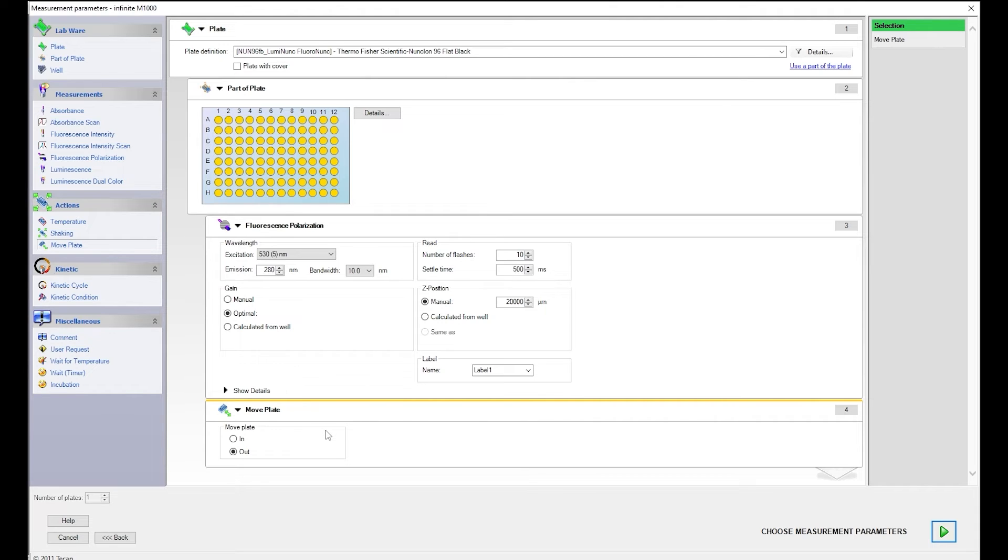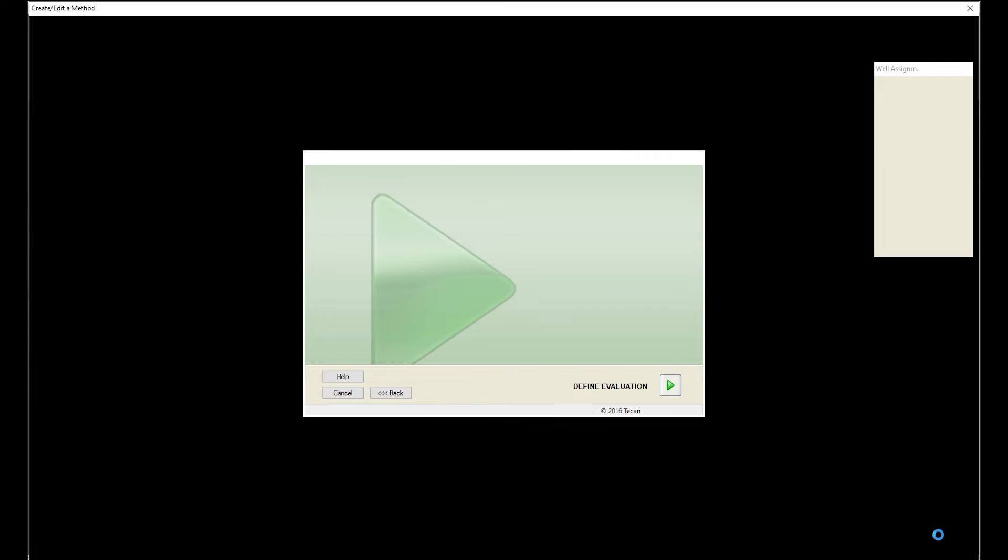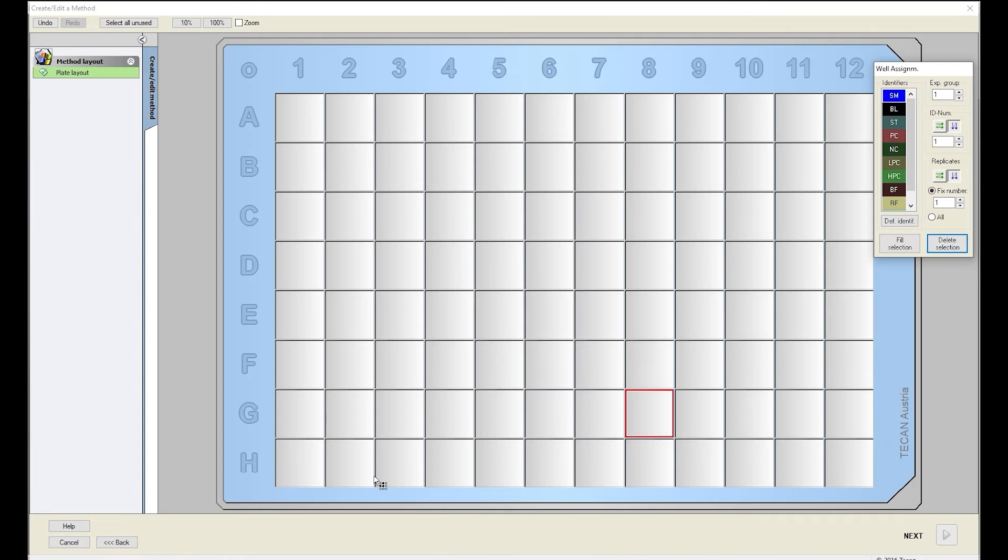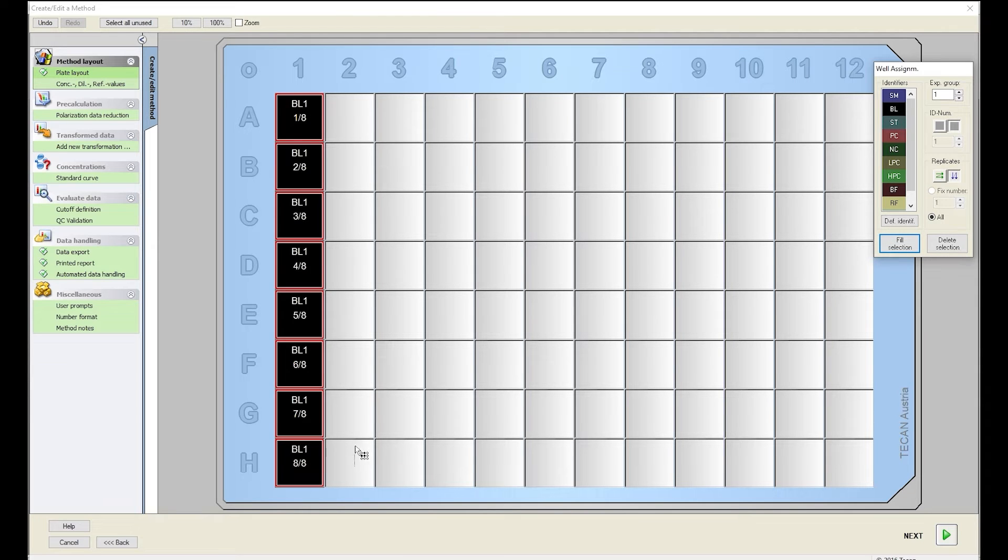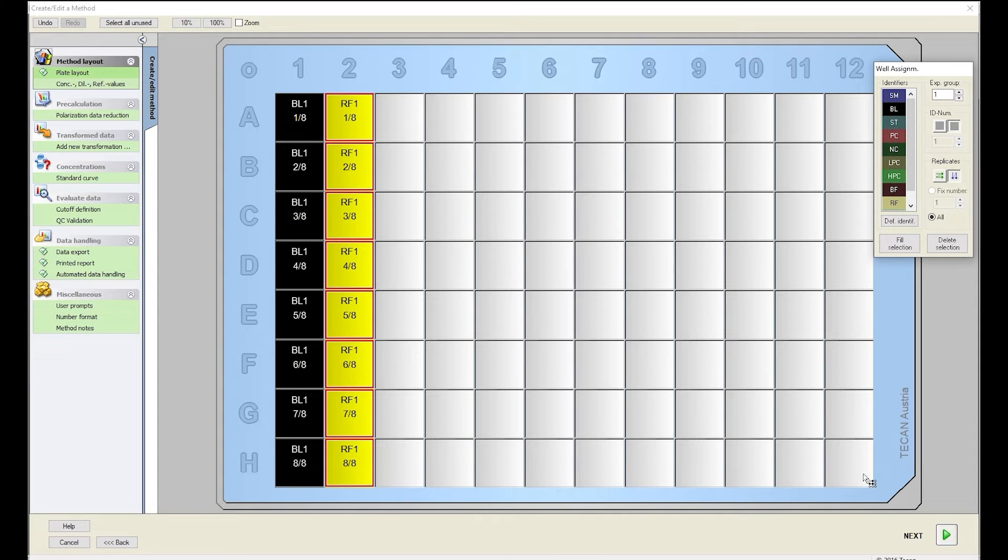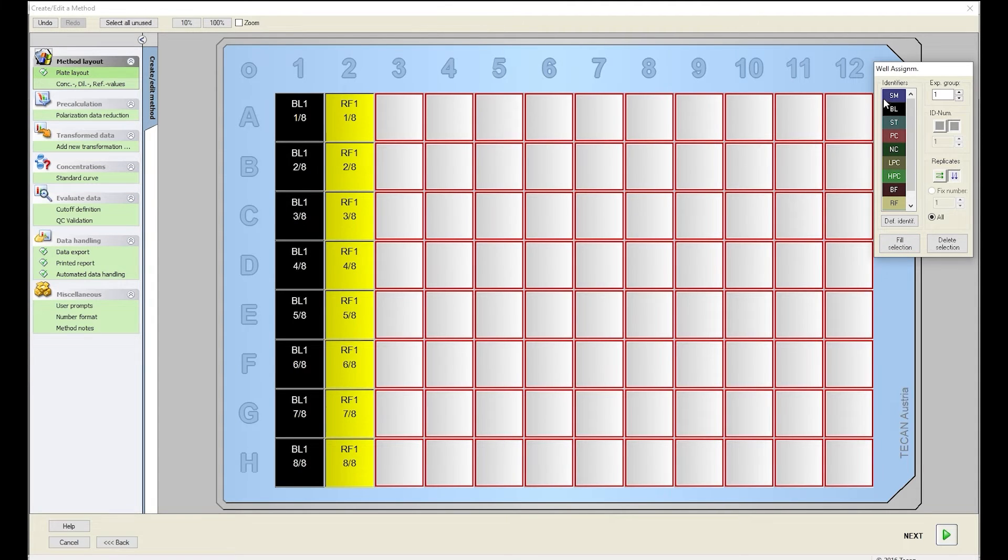Your method is ready to be used. Select Next. Select your blank, reference, and sample wells by highlighting the respective wells and selecting Fill. In a 96-well assay, we recommend column 1 for blank, column 2 for reference, and columns 3-12 for sample.